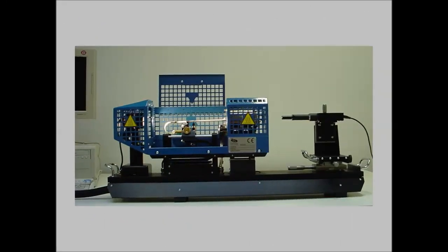Welcome to this short presentation of the Hot Stage Microscope MISURA HSM. This instrument was first developed by Expert System Solutions in the year 1990.